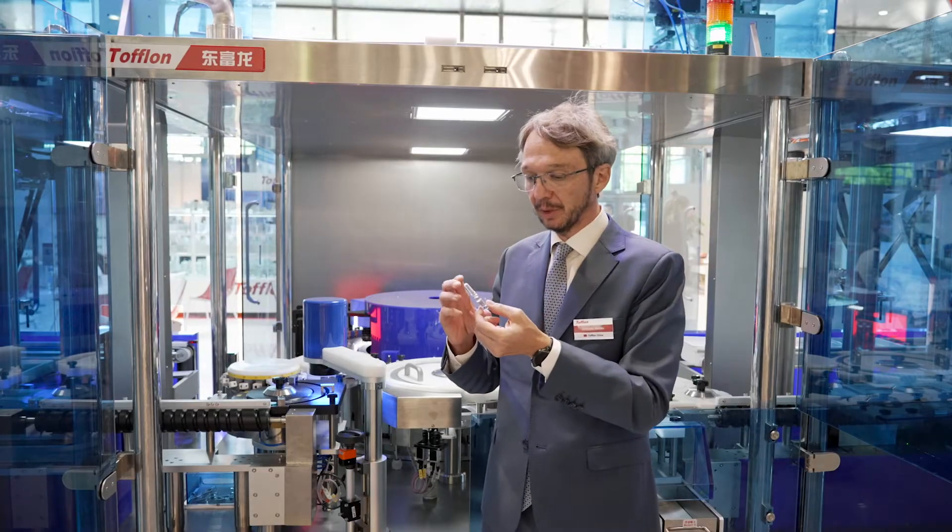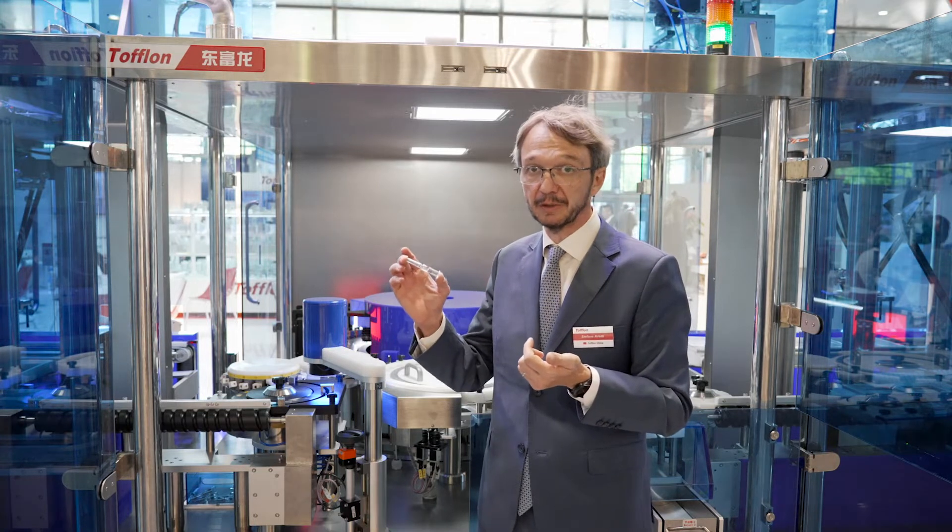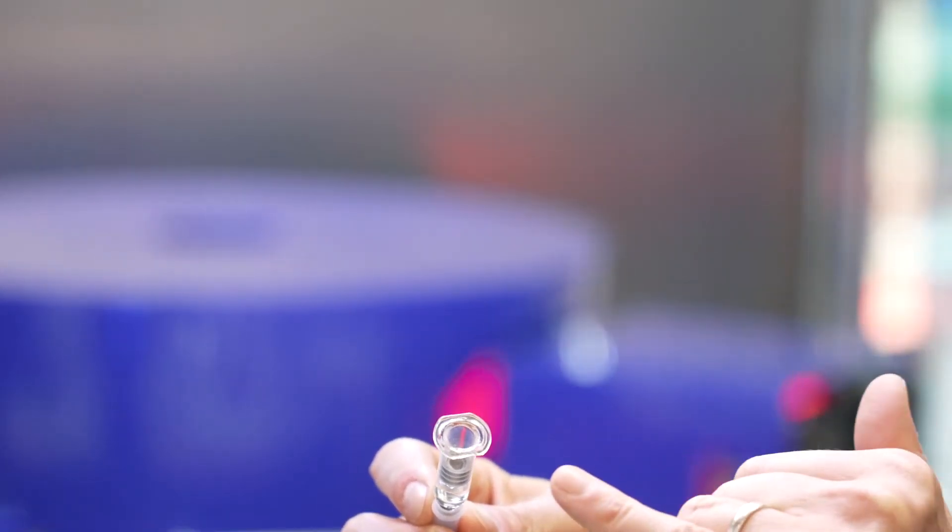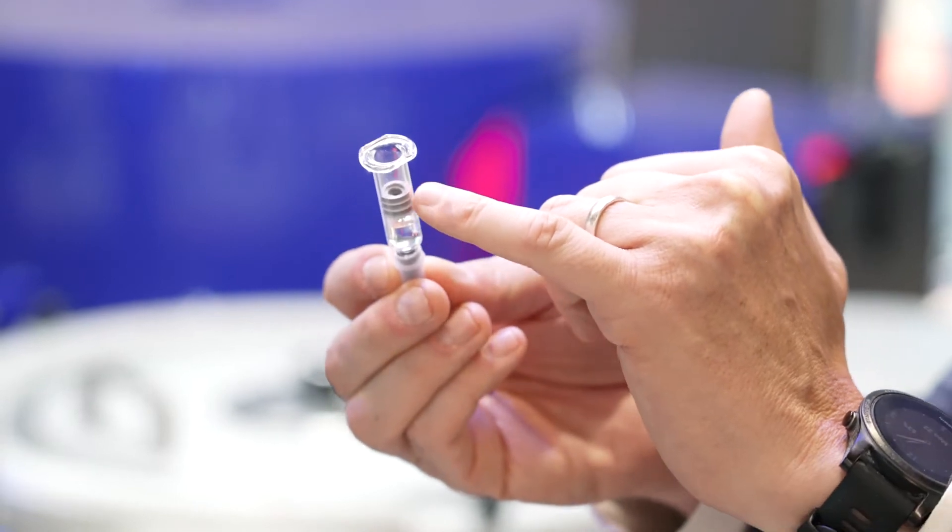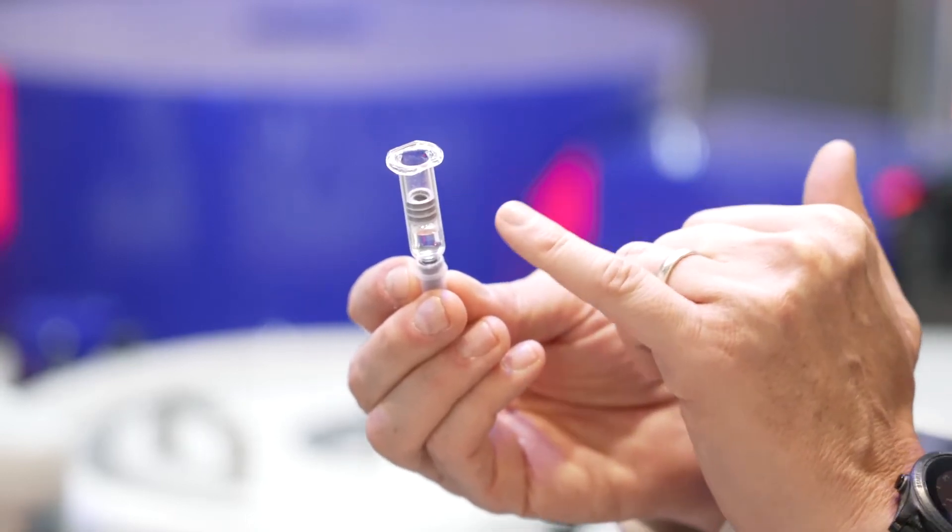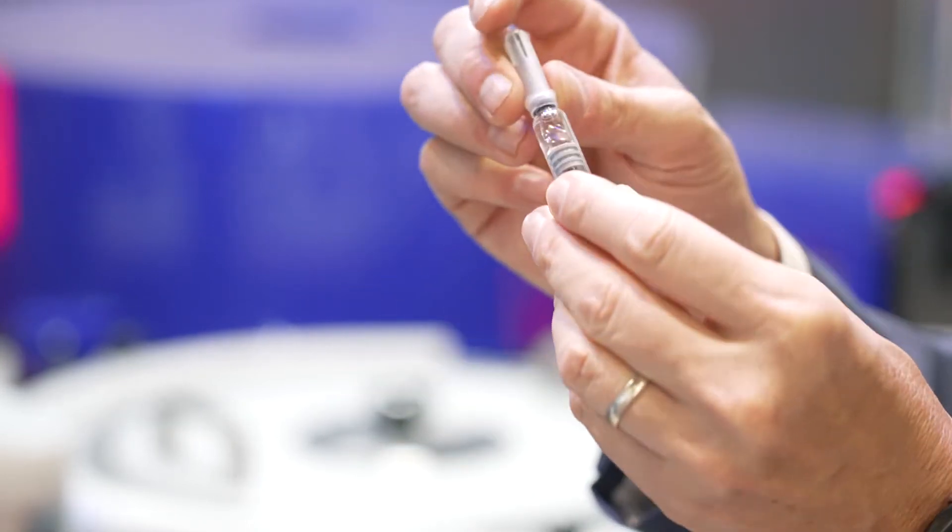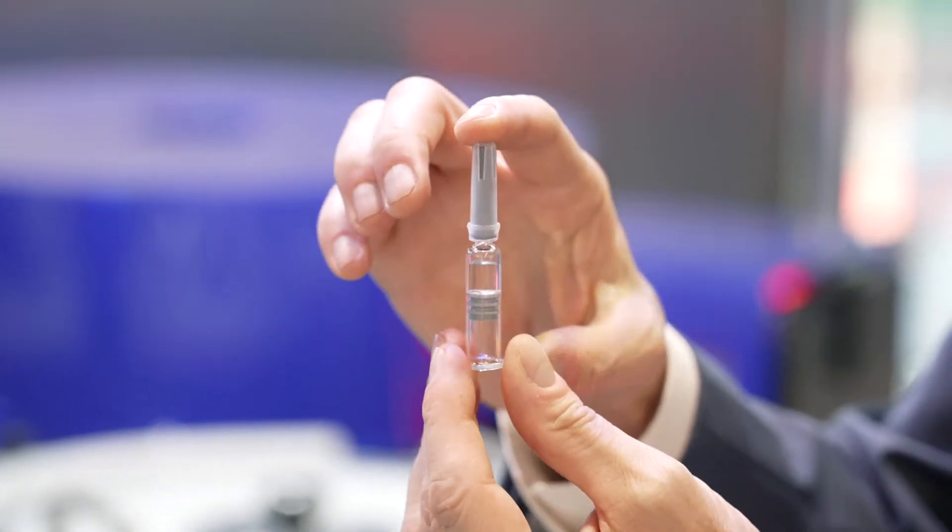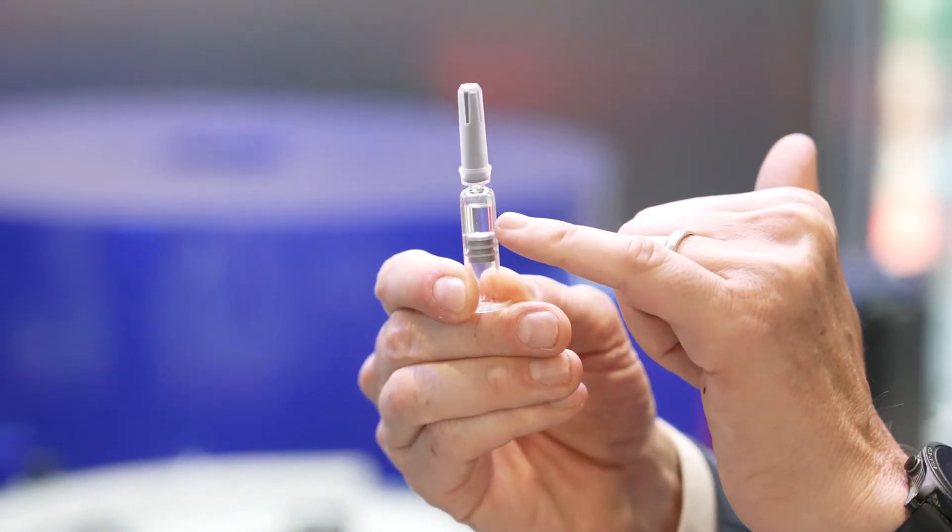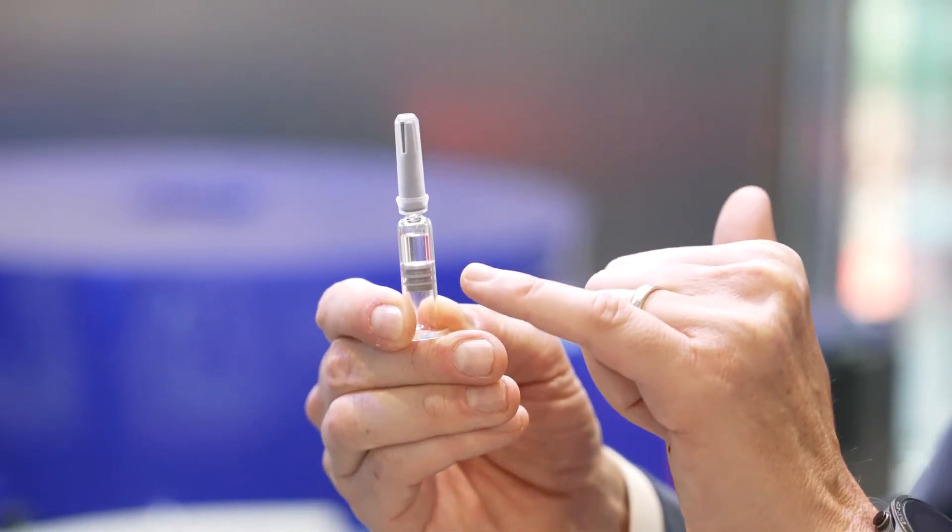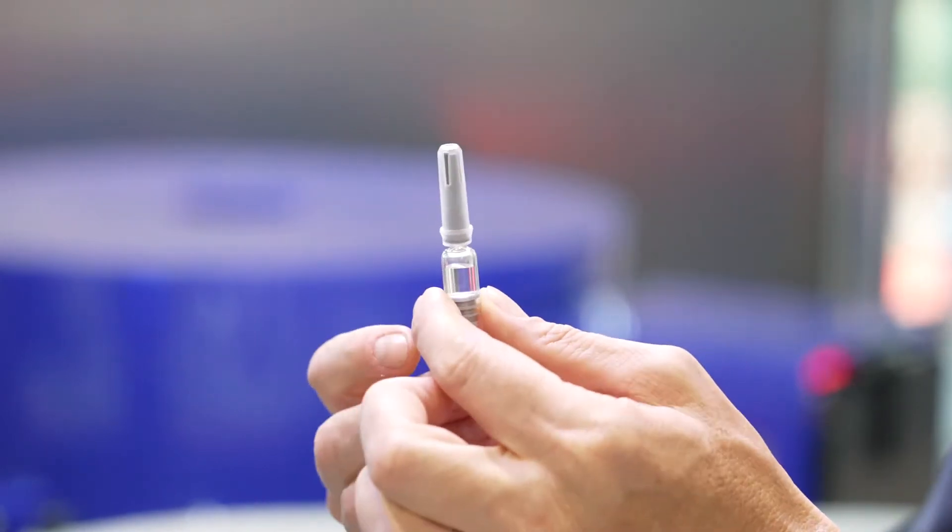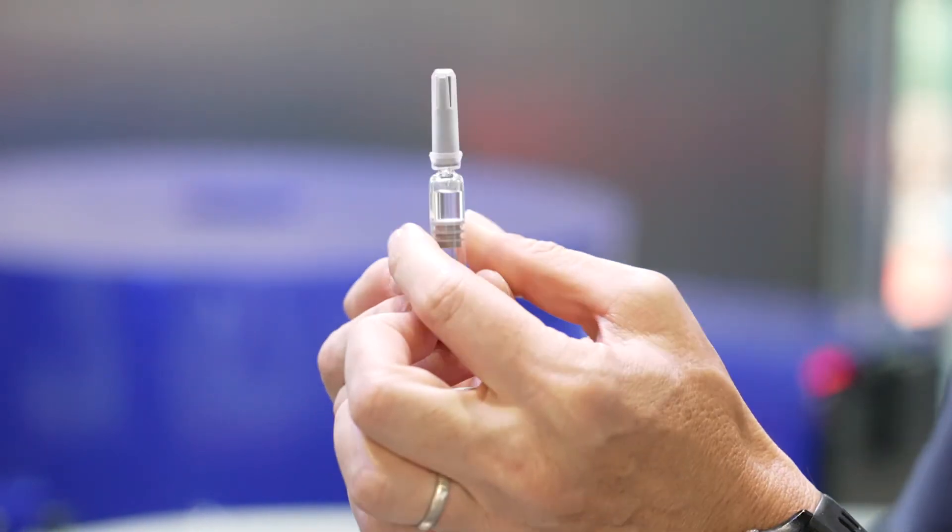Now I'm going to explain you more in detail what kind of inspection this machine can perform on pre-filled syringes. The first item to inspect is the flange and the presence of the stopper. We don't want the broken flange or missing stopper to enter the carousel. When this is okay, we turn upside down, the syringe enters the machine and we have the first inspection of the sidewall for defects in the glass like cracks or dirt or non-moving particle. This is made in front of camera. The container is slowly rotated.